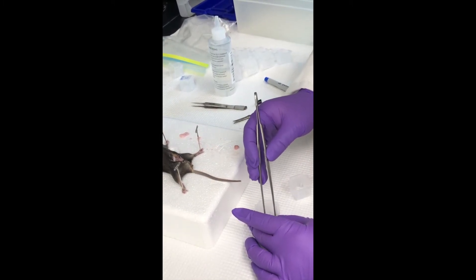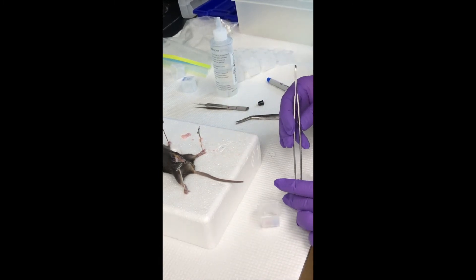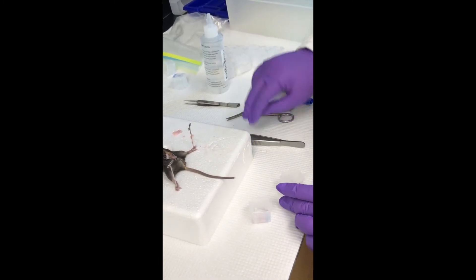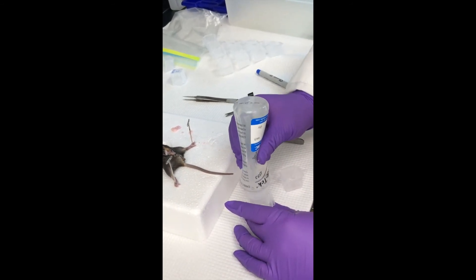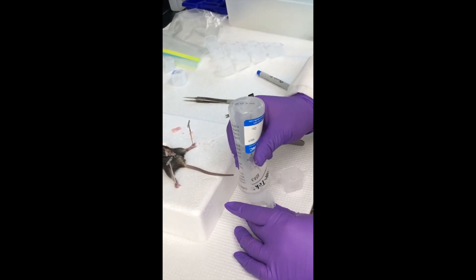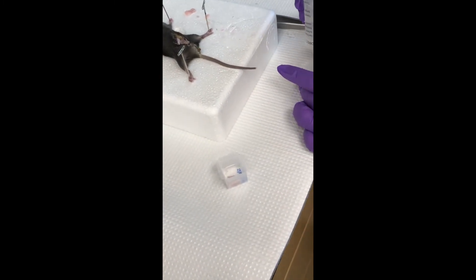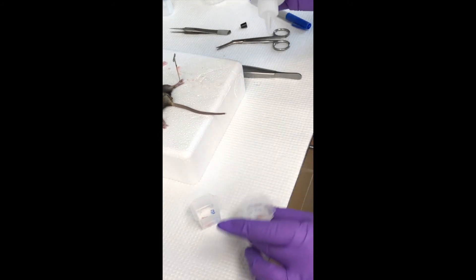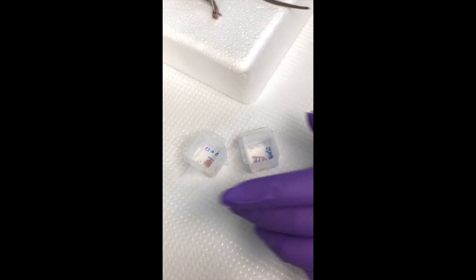It stands for optimal cutting temperature. So when you cut the block, this makes it so that it's the right temperature. And now I'm just going to put some more OCT on top — I don't have to fill it up all the way, I just have to cover it generously. So I put a little bit on the bottom but not a ton. There are a couple of little bubbles, but they're close to the top so I'm not going to worry about it.